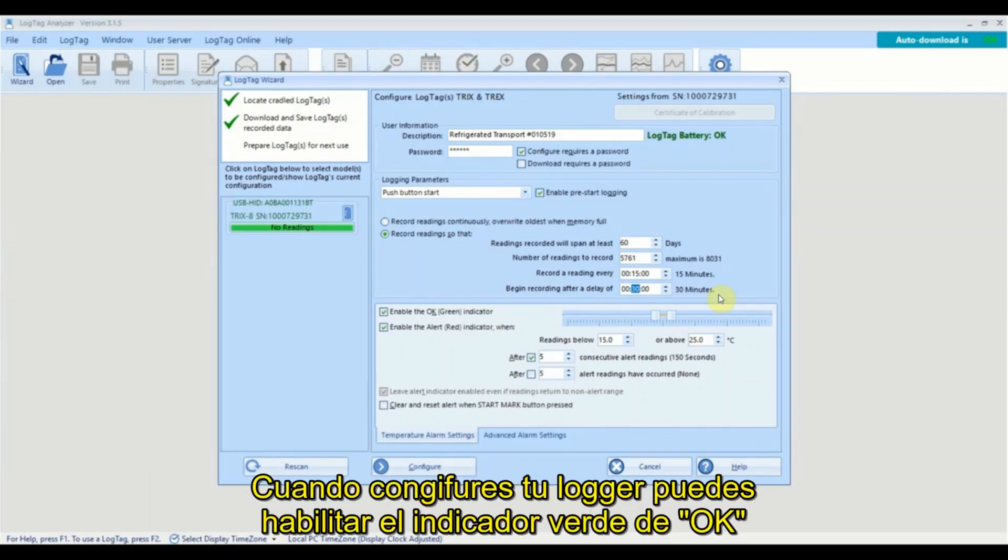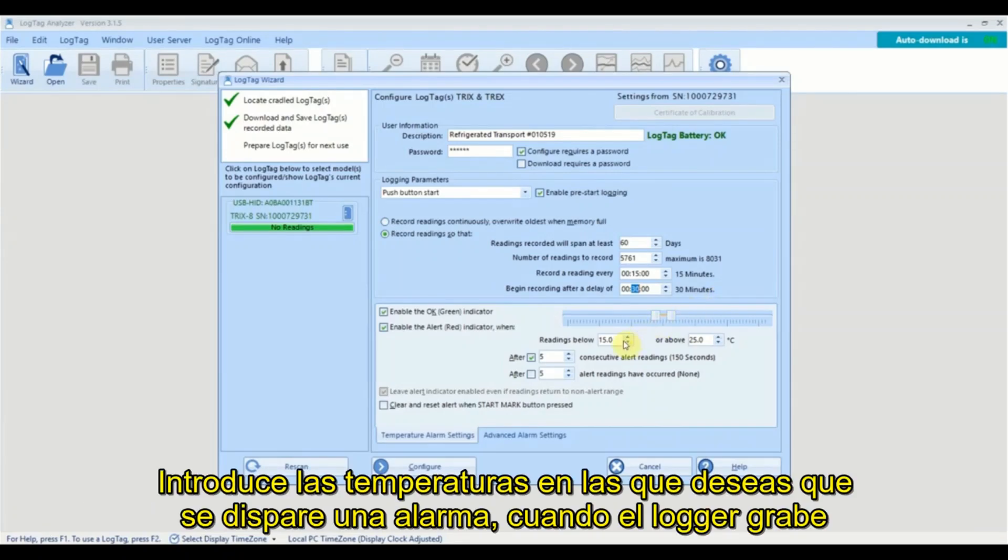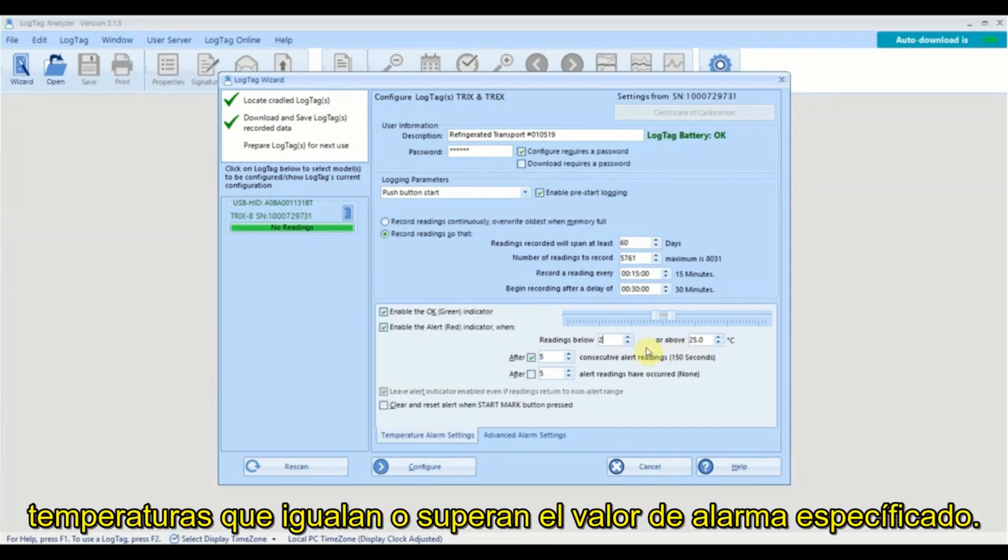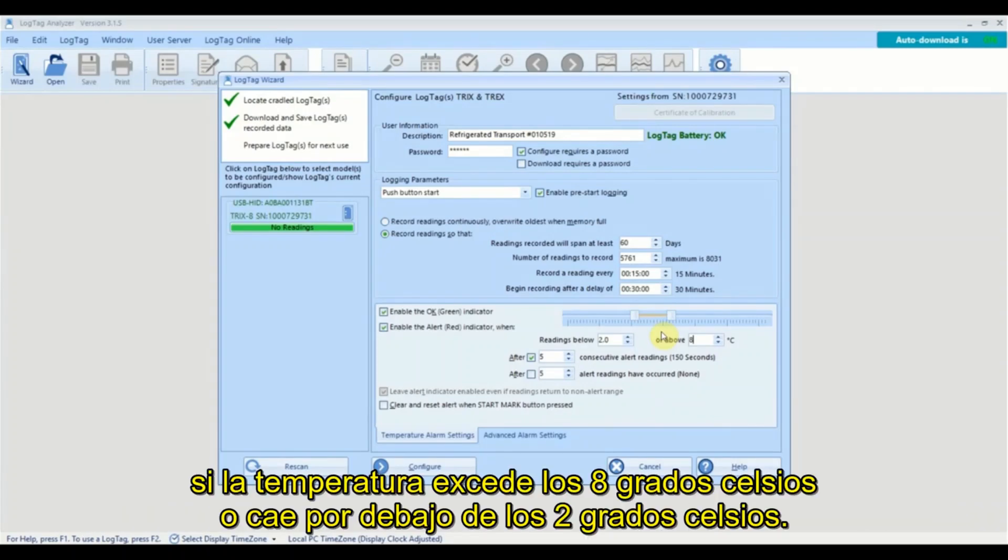When configuring your logger, you can enable the green ok and the red alert LED indicators to flash during recording. Enter any temperatures that you wish to trigger an alarm should the logger record a temperature that meets or exceeds the alarm value specified. In this example, the logger will immediately trigger an alarm if the recorded temperature exceeds eight degrees Celsius or drops below two degrees Celsius.